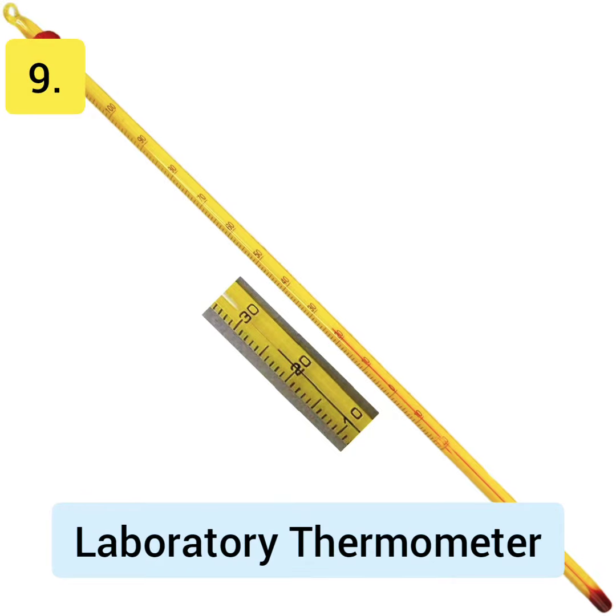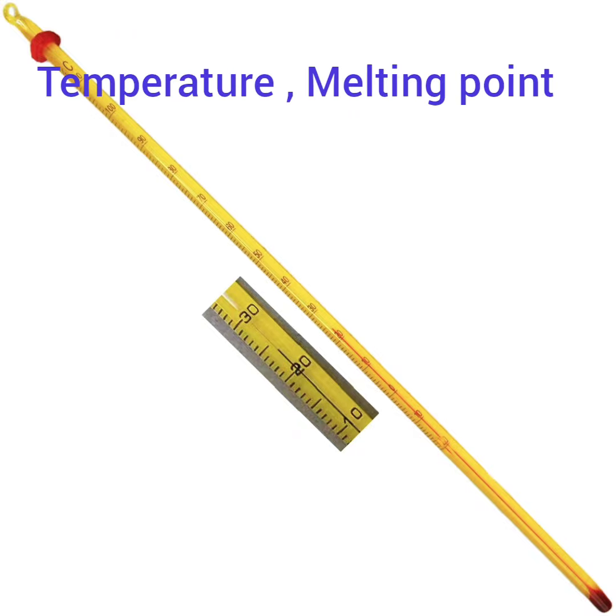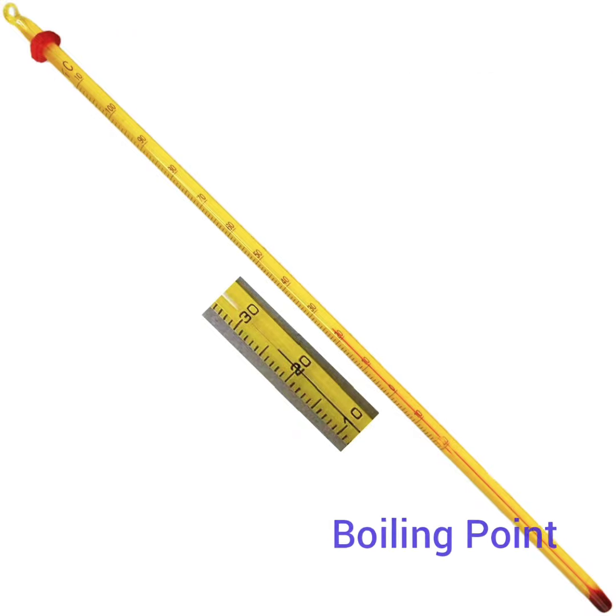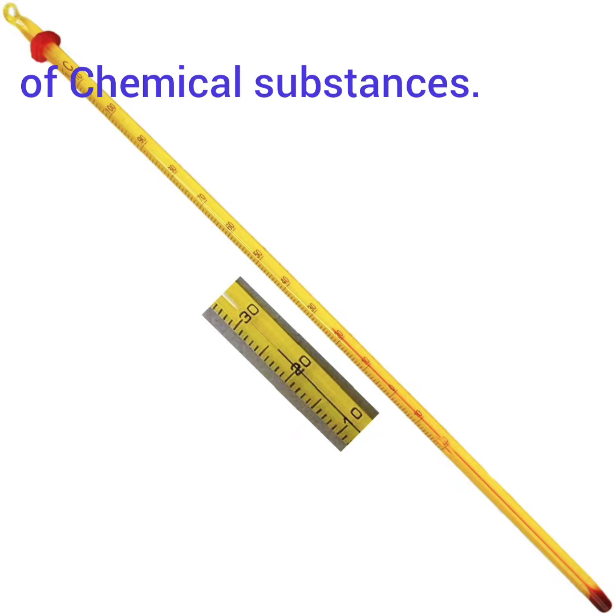Number 9. Laboratory thermometer. It is used to check the temperature, melting point, boiling point and freezing point of chemical substances.